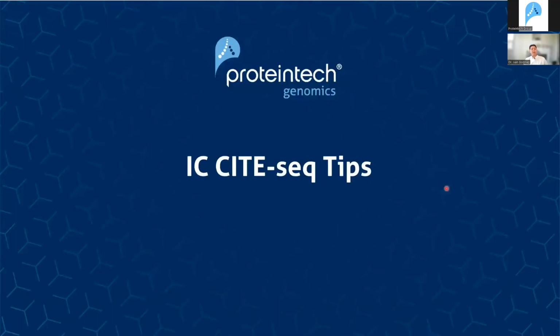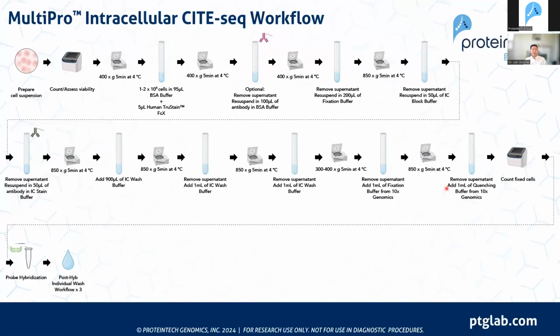All right, so now I want to segue over to intracellular CITE-seq tips. I'll start off by breaking down in a bit more detail, although not complete detail, the overall workflow. I'm not going to go into a terrible amount of detail because it gets a little repetitive. But one of the things I want to highlight is that this assay really depends on a few things: your technique when it comes to aspirating off supernatants and the selection of the correct centrifugation systems. I'll talk about that in just a little bit, right?